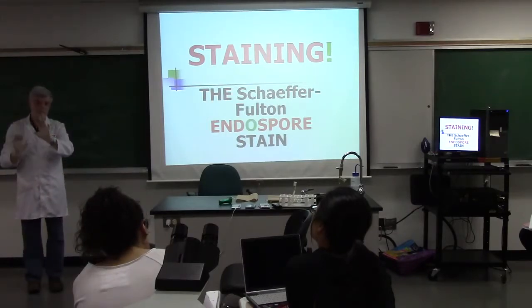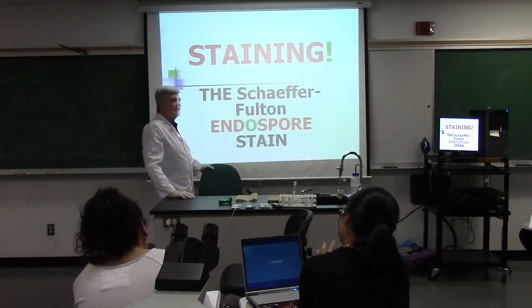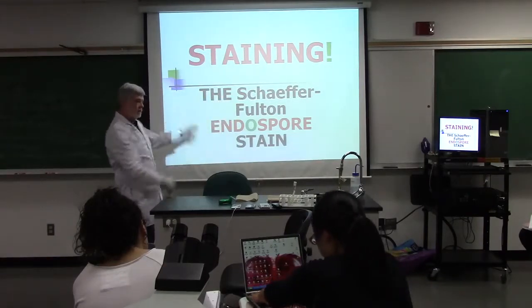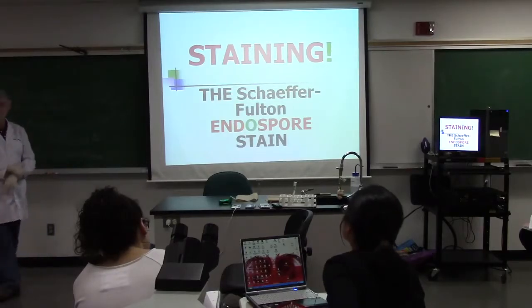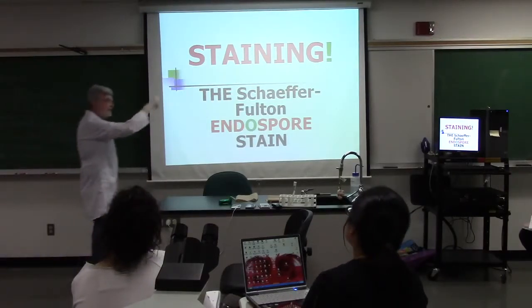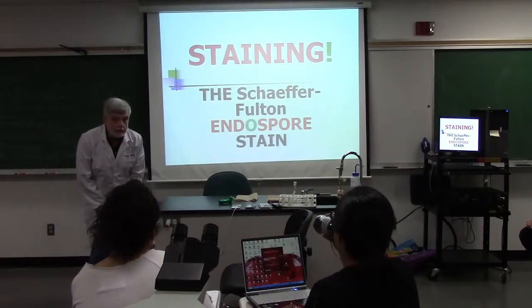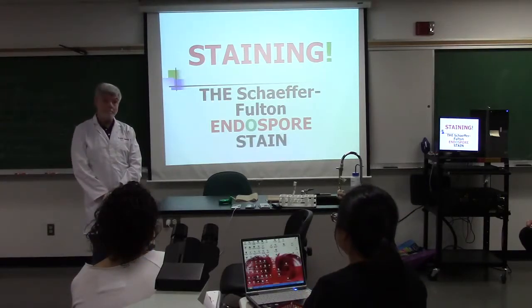What color do you think that is? Green. Okay. Now, why is there so little green on this picture? Because usually the primary stain, I put a big old long word in the primary color and a big old long word in the secondary color. But in this case, there's only 2 of these letters on this whole slide that's green. And the answer is, forget green. Forget it. If you are looking for green, you're going to miss this stain.